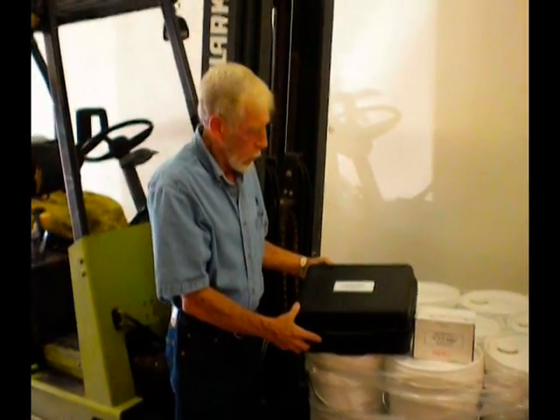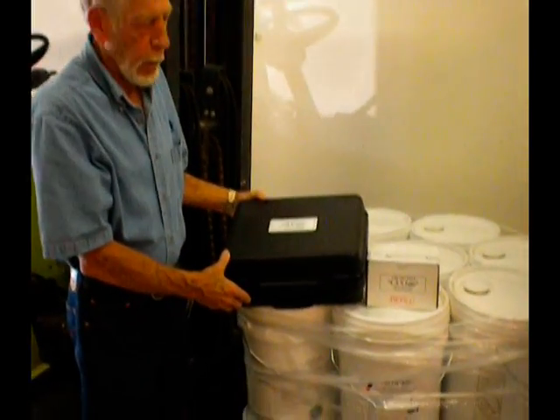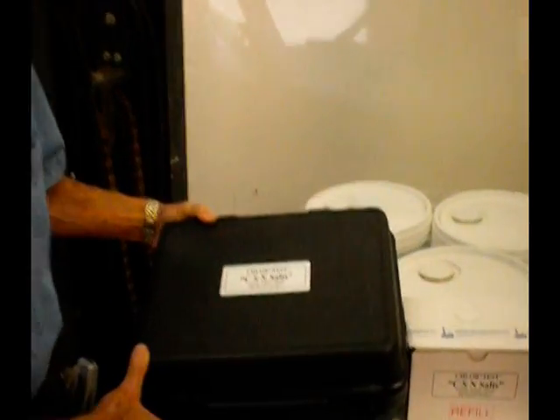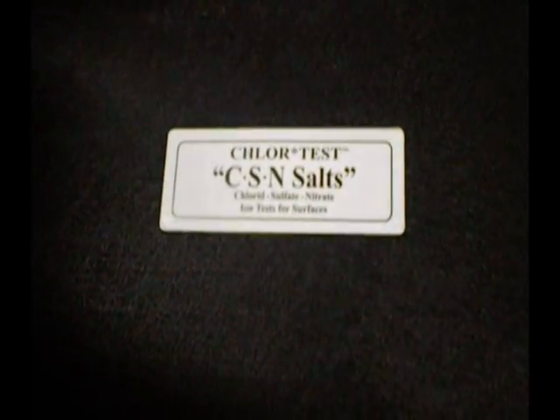We're going to go through the CSN salts chlor test kit, listing the components and how they're used, and actually perform a test so you can see how it's done.